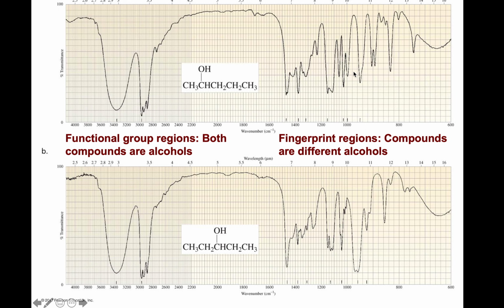For example, you see this band and this one? You can see the scissor on this one, and it's not appearing here. We can differentiate between these two constitutional isomers. Incidentally, you see this big broad stretch there and there? That's your OH stretch, alcohol stretch. These are your hydrocarbon stretches. Note there to the right of 3000, no pi bonds. sp3 carbon H stretches. Same there.